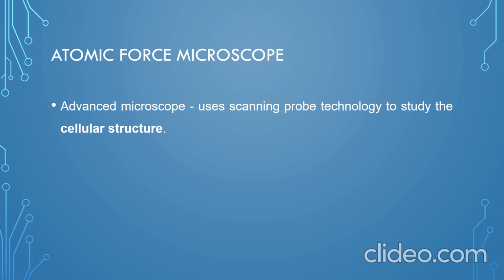I didn't go in depth about the transmission electron microscopy and scanning electron microscopy and their pathway, how it works also.